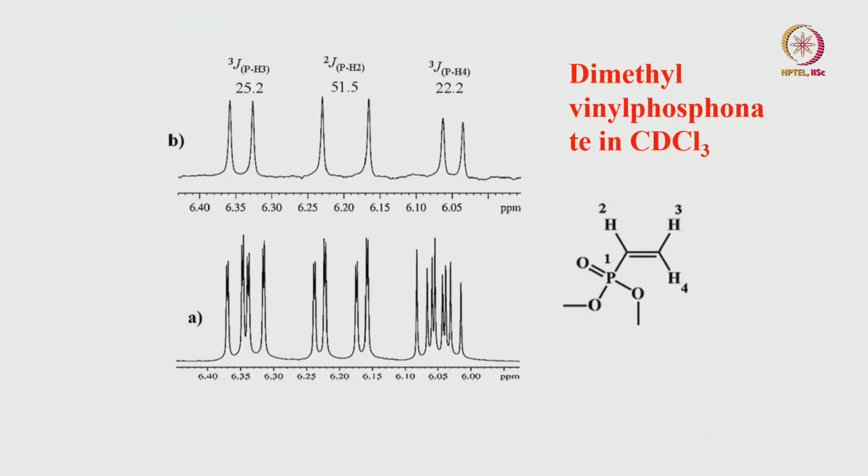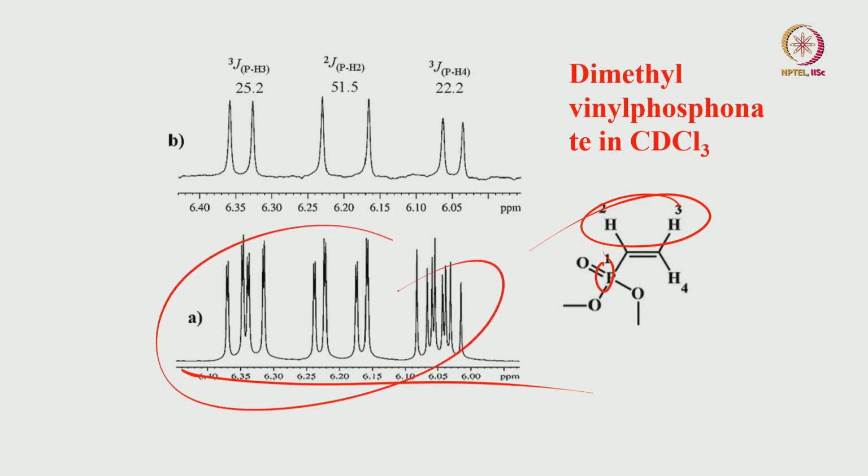And look at this molecule, we have phosphorus here and proton-proton couplings. This spectrum has both HH coupling and PH coupling. Both phosphorus-proton and proton-proton coupling complicate this spectrum. Do the pure shift here, HH couplings are removed. Each of these, if you measure the doublet separation, gives you phosphorus-proton couplings.